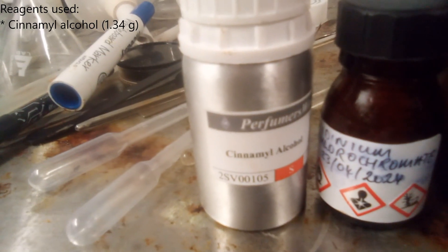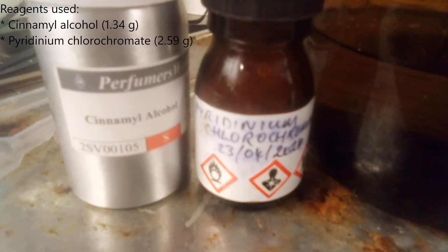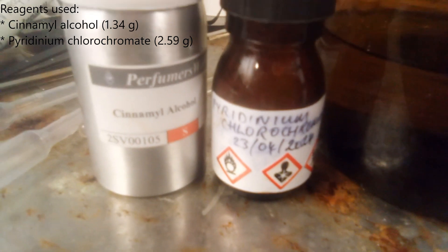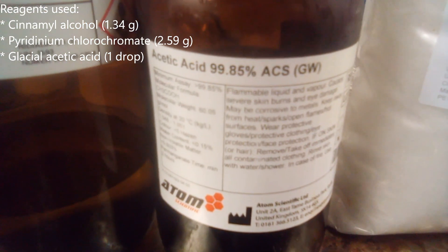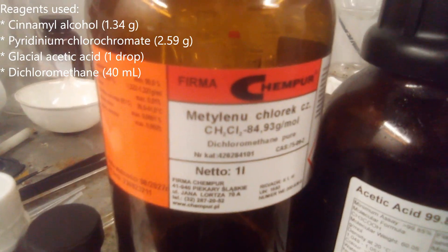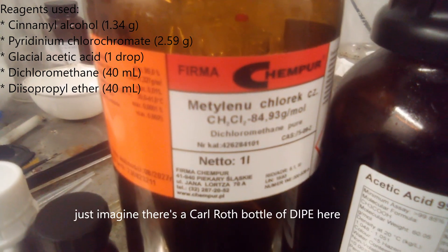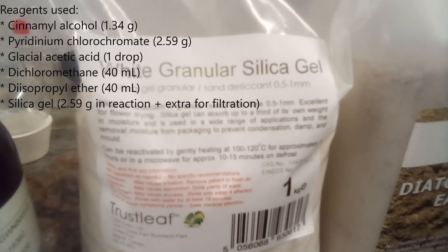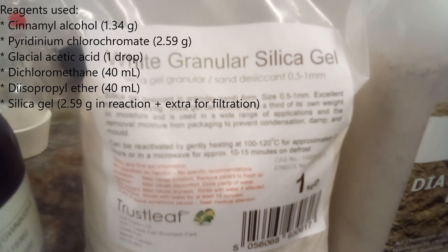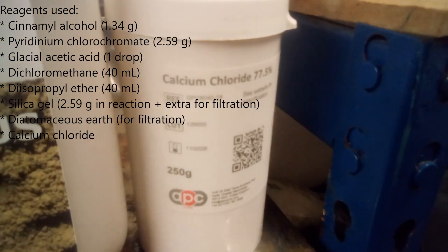Reagents used were: cinnamyl alcohol, 1.34 grams; pyridinium chlorochromate, 2.59 grams — PCC I made earlier; glacial acetic acid, one drop, approximately 0.03 grams; dichloromethane, 40 mL; diisopropyl ether, 40 mL; silica gel, 2.59 grams — the gardening-grade sand type, not the big beads; diatomaceous earth, also gardening grade; and calcium chloride.